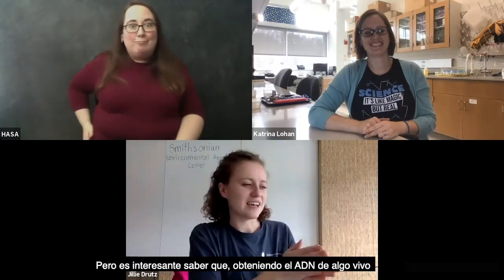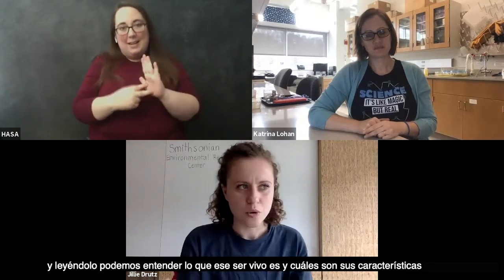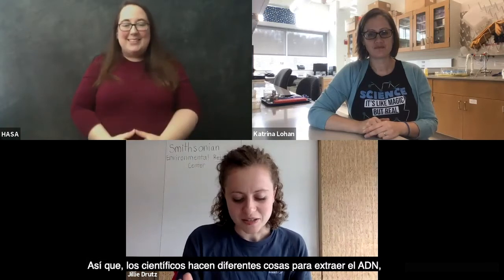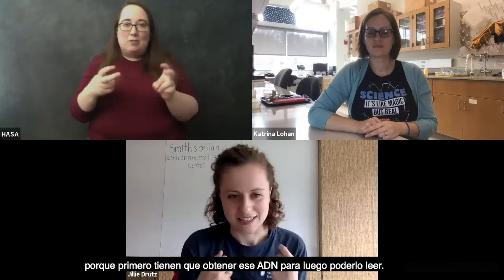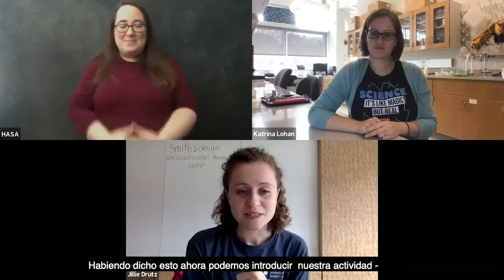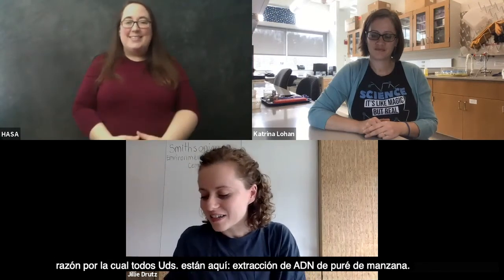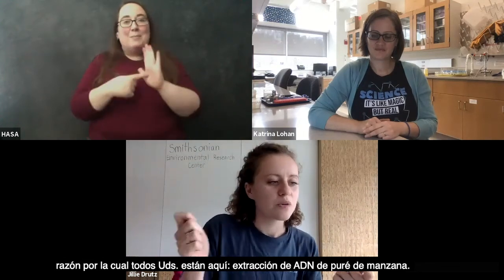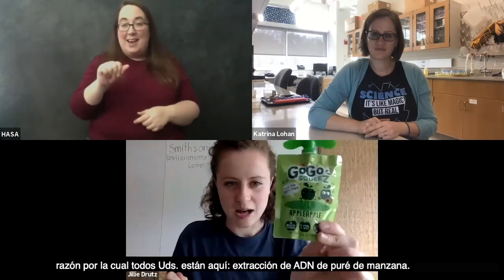How do you get the DNA from something and read it so you can understand what it is, what it's about, all of that? Scientists do a lot of different things to extract the DNA. You first have to get that DNA before you can actually read it. So that brings us to our activity and why you all are here today. What we're going to be doing with that activity is taking the DNA out of the cells of the applesauce.